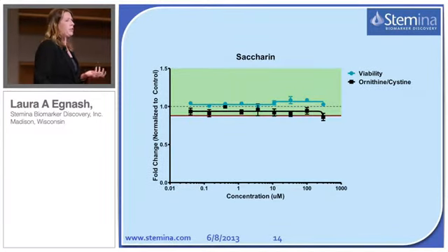And then I want to show you a non-responder as well, saccharin. Again, the viability does not change, nor does the ratio, as would be expected.